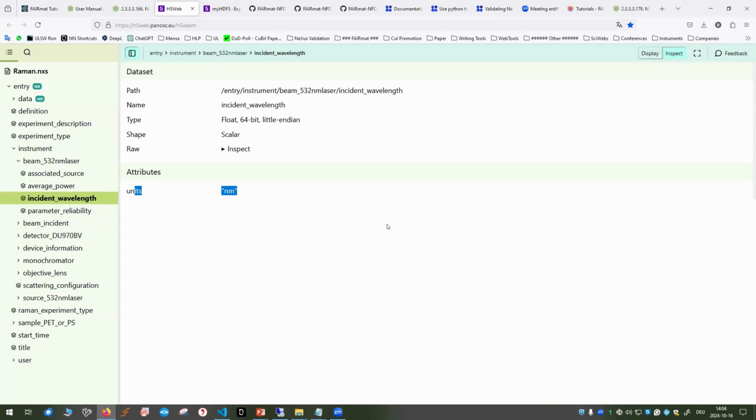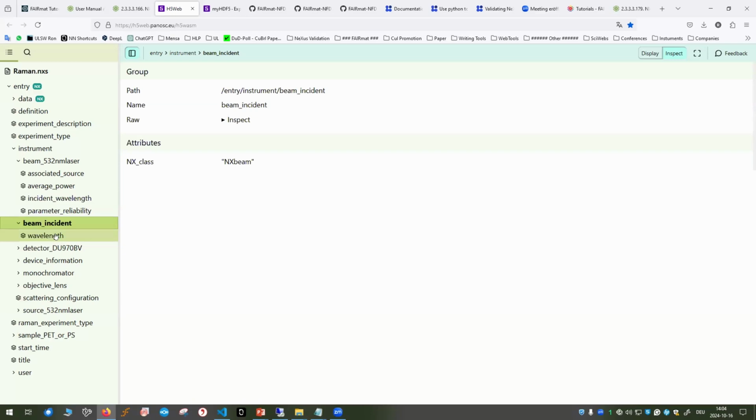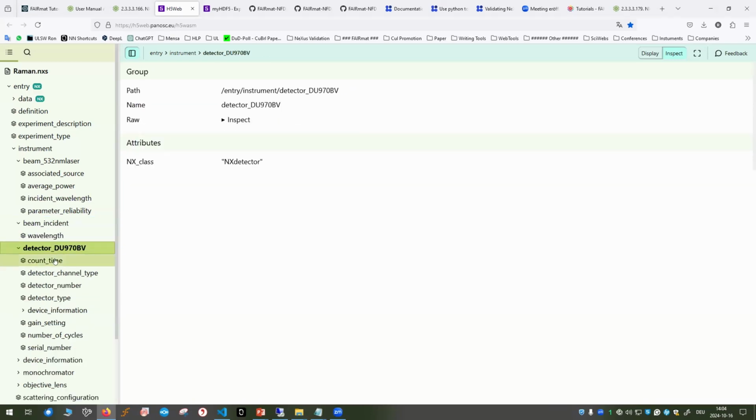All right. I hope that you can open these files. If someone has a problem, please let us know if we can help somehow. It would be cool if you could take at least a short look into the file and click through it a little. In principle, this file is a representation of how such a FAIR data file can look.